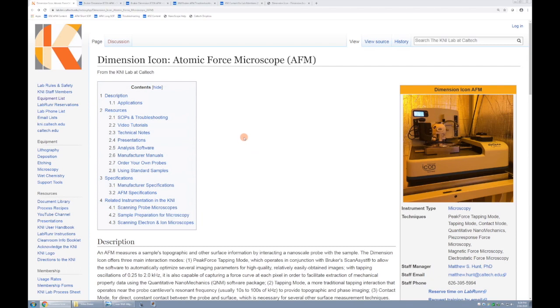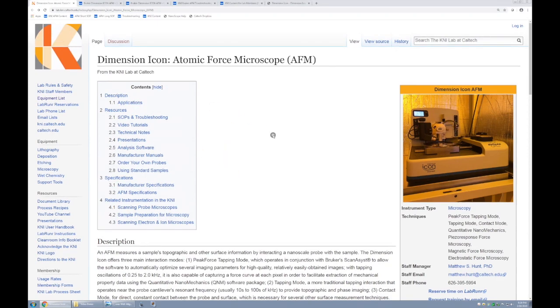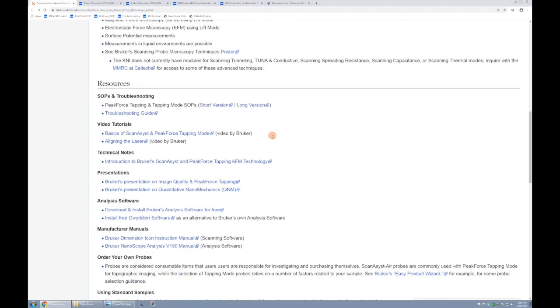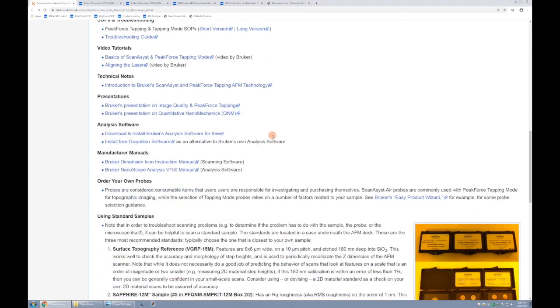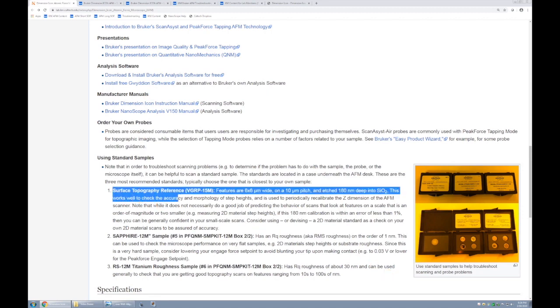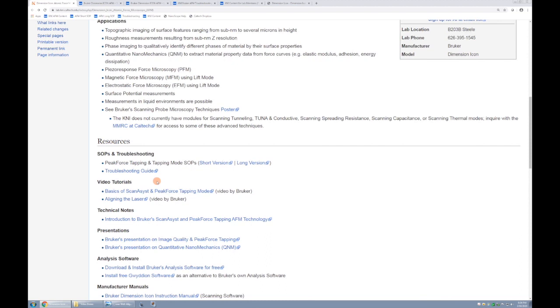In this series of videos we'll be going over the basics of atomic force microscopy on our Bruker Dimension ICON AFM. I'll point out that we have a wiki page for our AFM on our KNI lab wiki, and if you scroll down on that page you'll find all the resources for the AFM, including a look at the different standards that we have. We'll be taking a look at the surface topography reference in these videos, and also I'll point out our SOPs and troubleshooting guide.